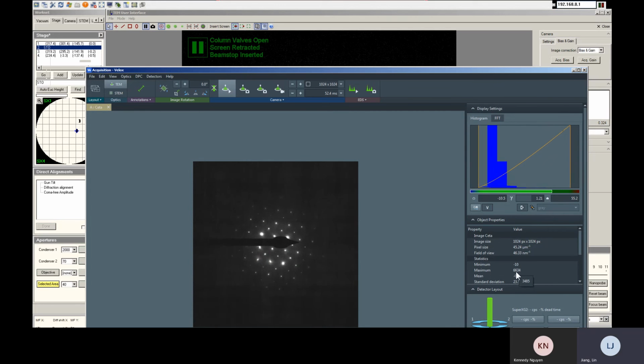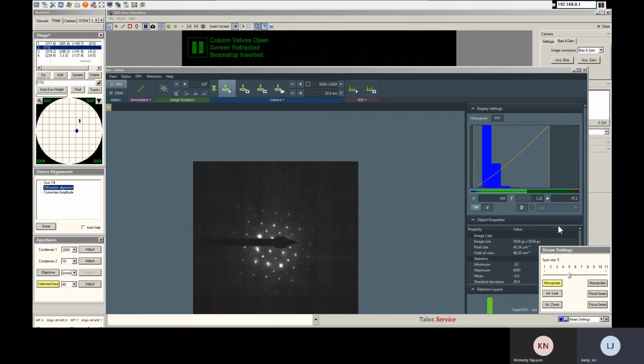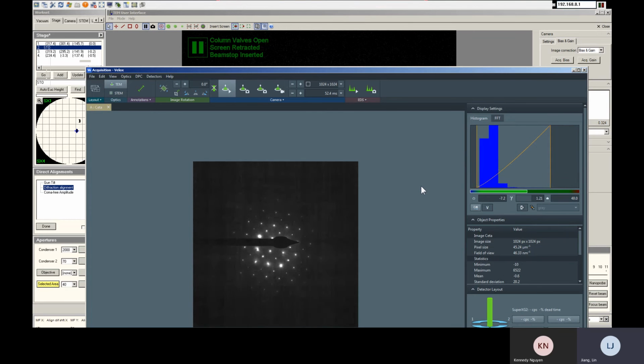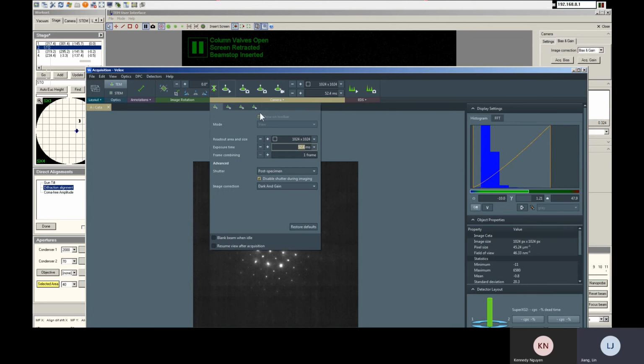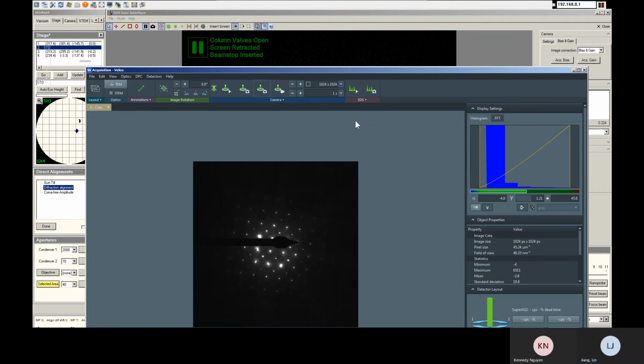Okay, that's good, right? It's about 6,000. It's below 7,000. You can use the diffraction element here to block the central beam. Once you feel good with that, you can just stop view, set up the acquisition. You go 1 second, 20 frame, and then you can acquire image. This is how simply we take an imaging.